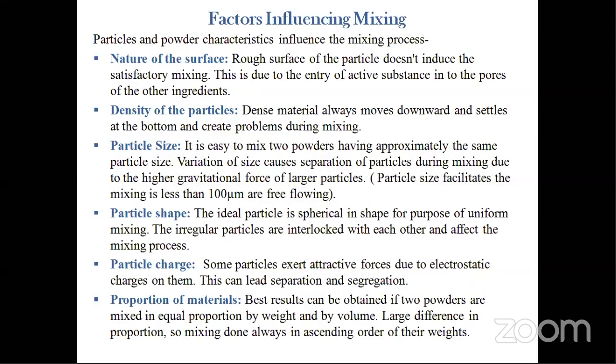The mixing process automatically stops. Your baffles and paddle are not moving in between the powder and the vessel. So if you have two or more powders, you have to put them in equal proportions by weight and volume. If you take 60% of paracetamol, you have to take 60% of alprazolam or the other drugs. Those volumes should be in the same proportion in the mixing process.